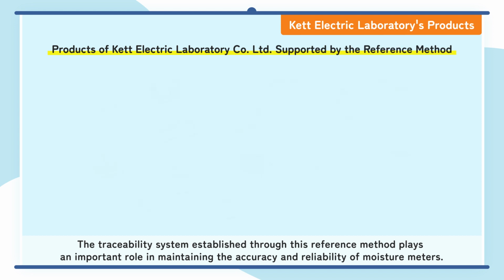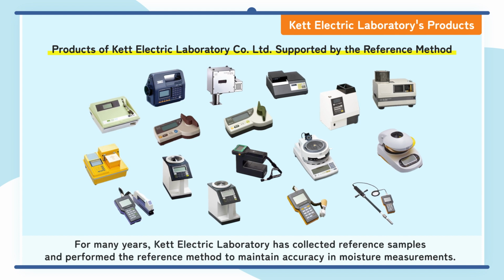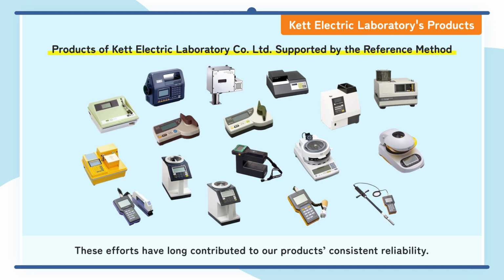The traceability system established through this reference method plays an important role in maintaining the accuracy and reliability of moisture meters. For many years, Kett Electric Laboratory has collected reference samples and performed the reference method to maintain accuracy in moisture measurements. These efforts have long contributed to our product's consistent reliability.